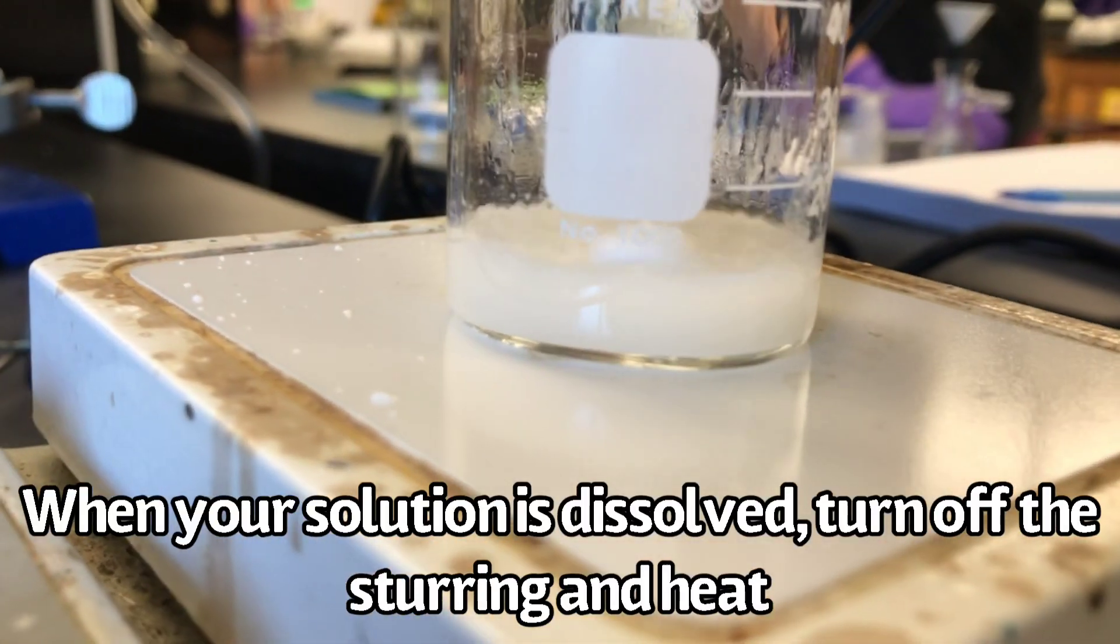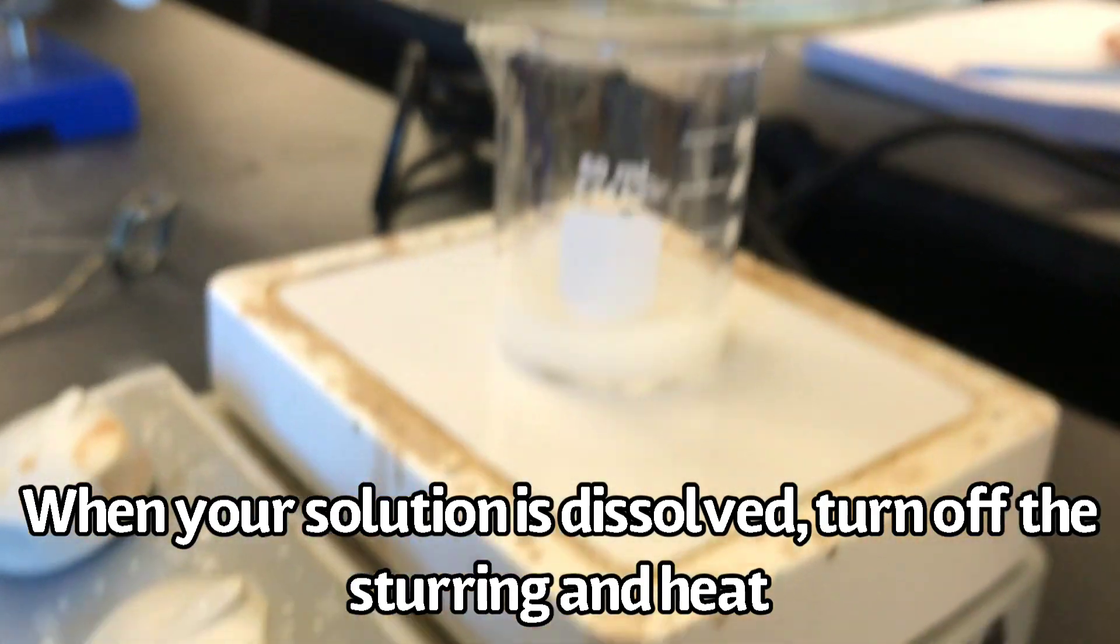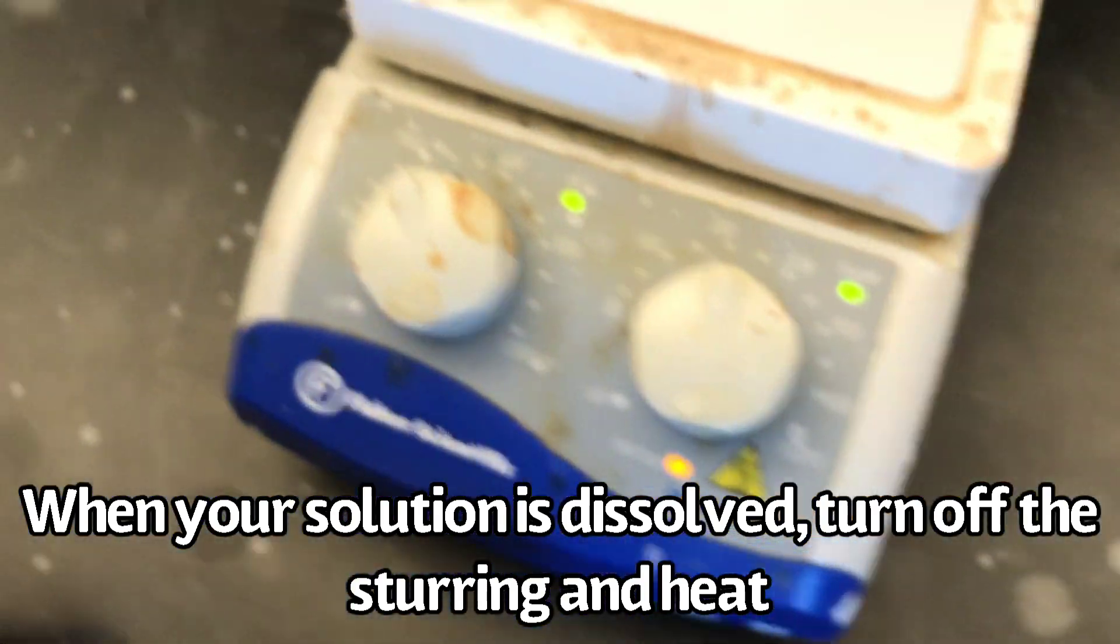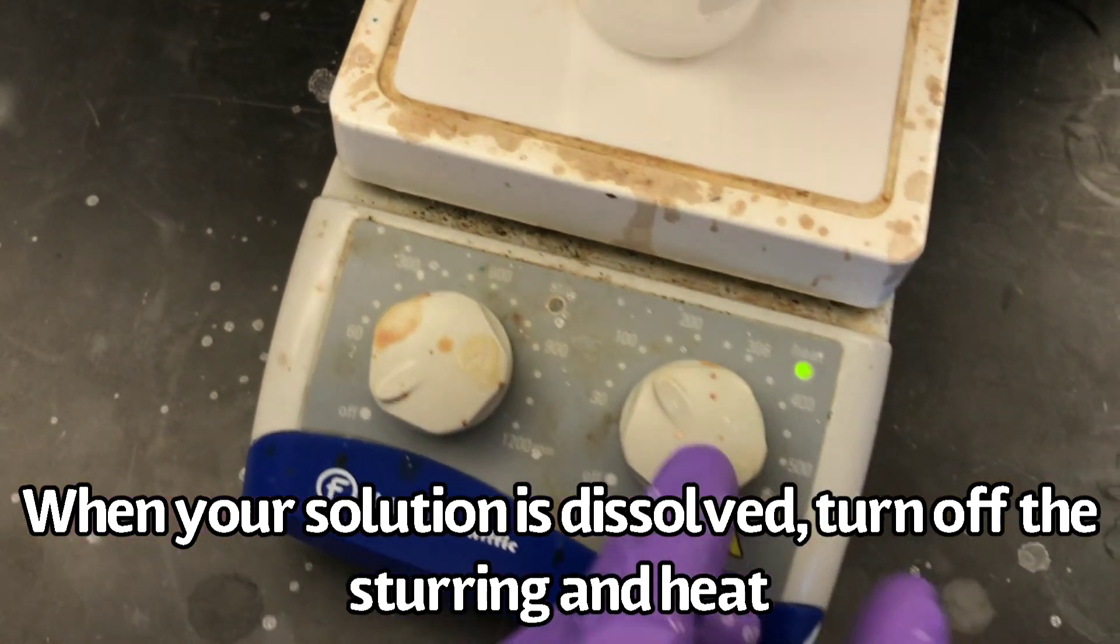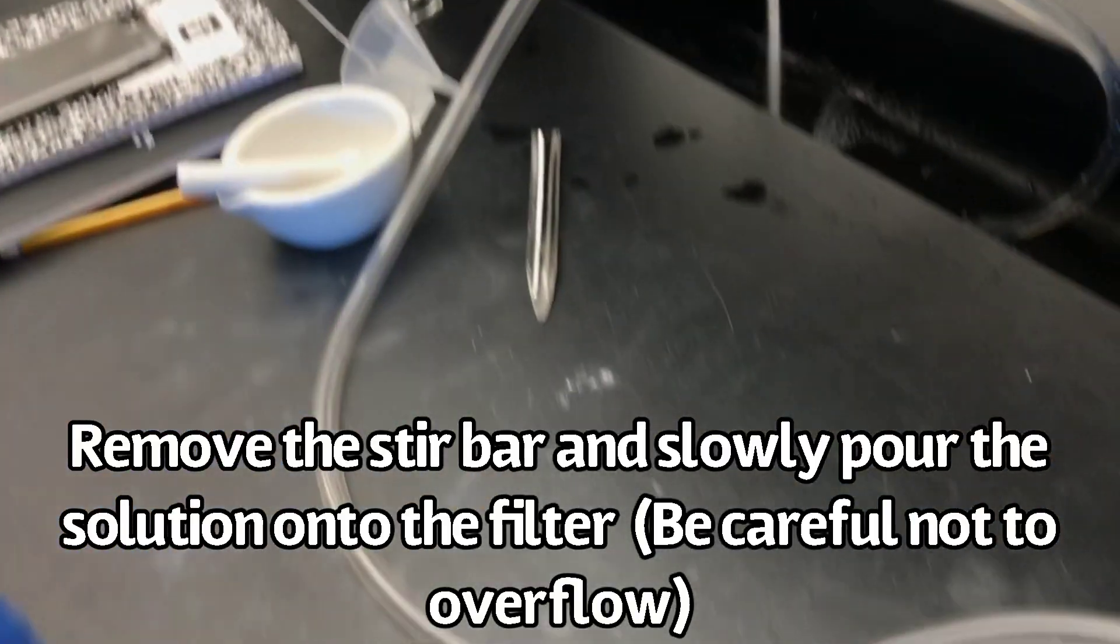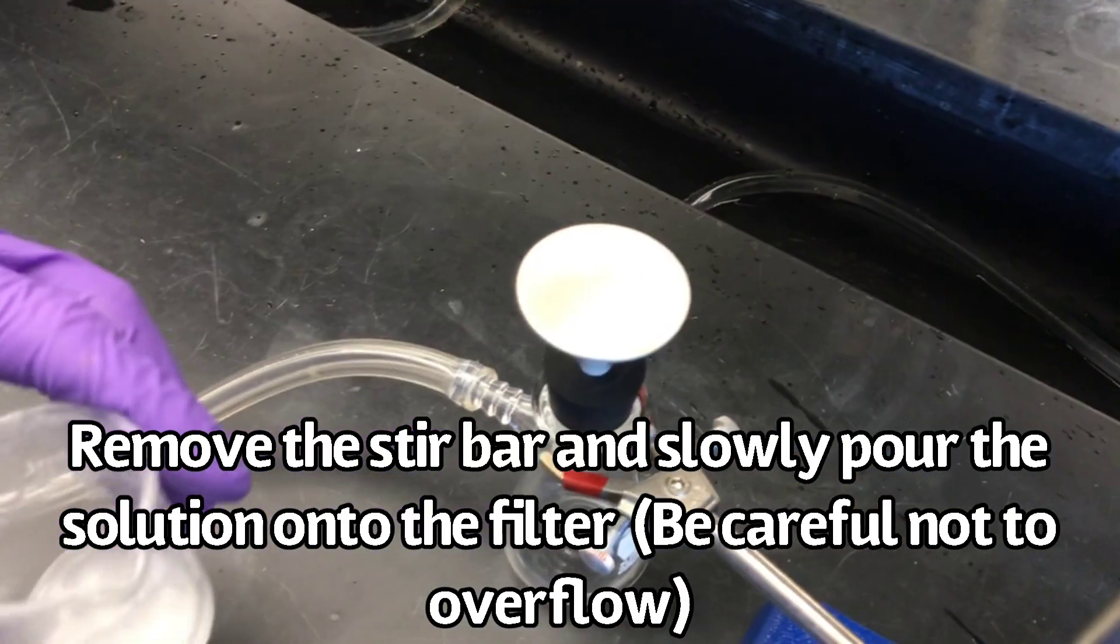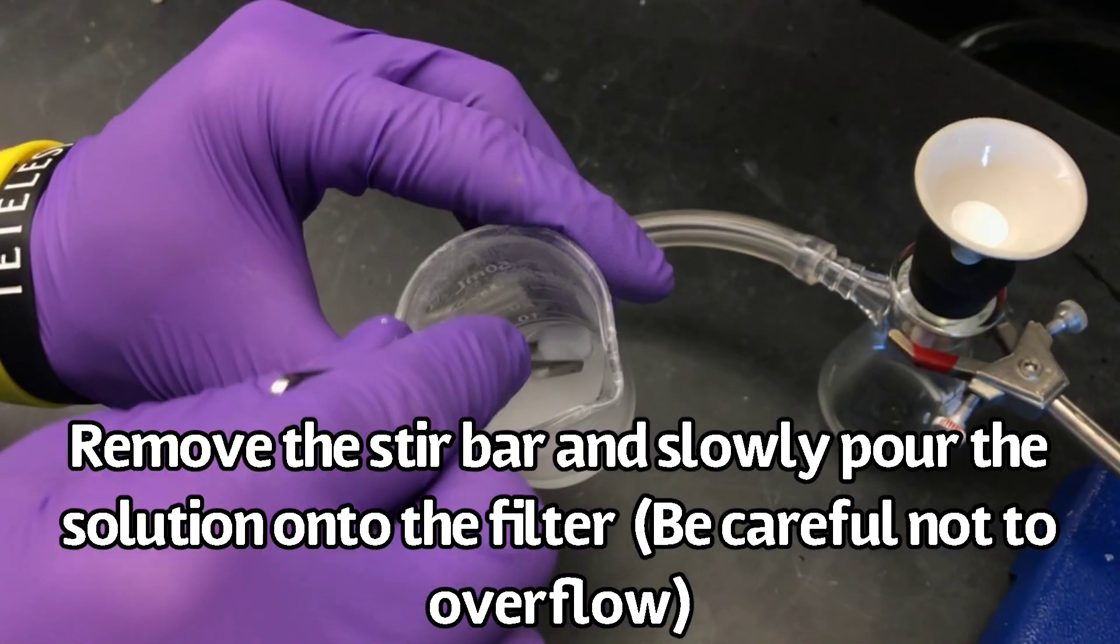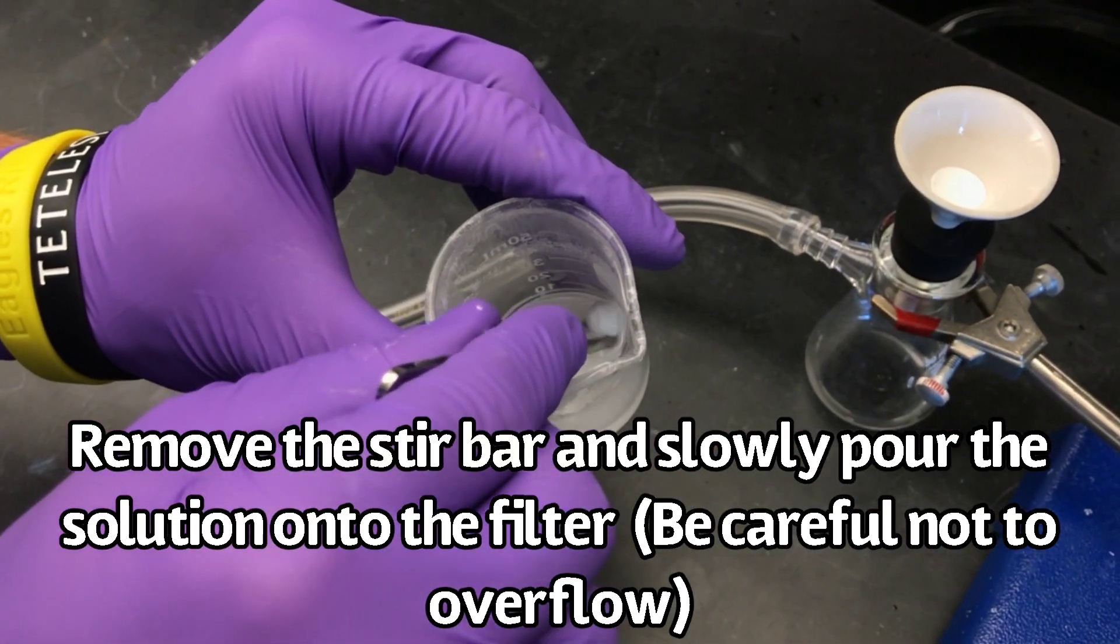When the solution is completely dissolved, turn off the heat and the stirring. Remove the stir bar and pour the solution into the filter, being careful not to overflow the funnel.